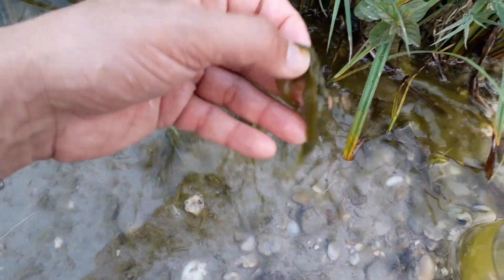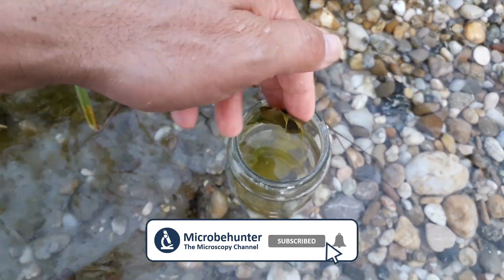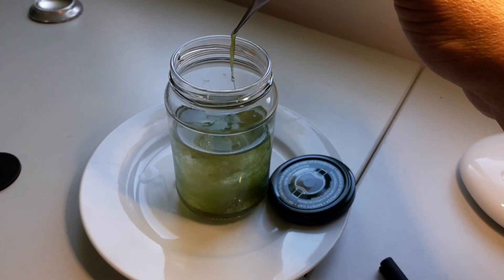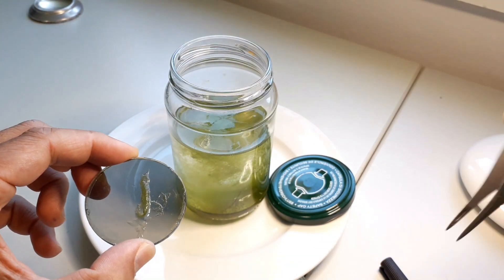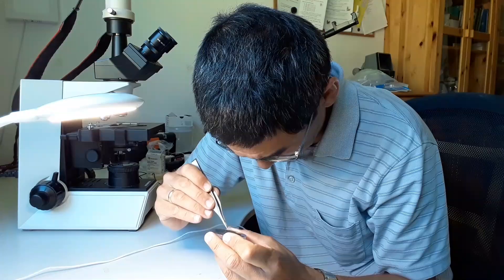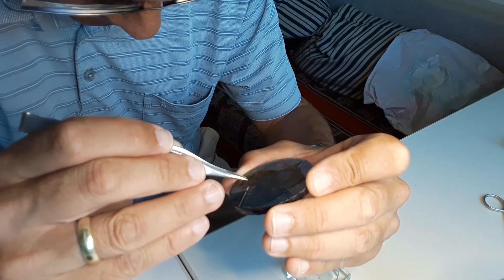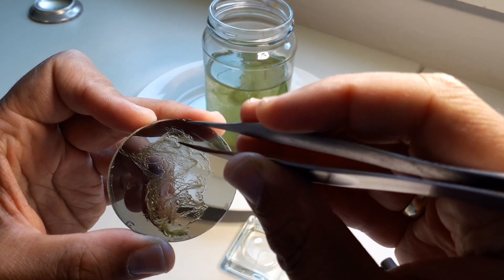First the work, then the fun. Before I cut apart the worms I have to find them first, and this is how I collected them. They can be found living in algae, which I took home in a glass jar. At home I placed some of this material on a glass plate, separated the algae, and tried to find them. They were tiny, so I spent quite a bit of time searching through the material, and I collected around five of them — which took me maybe half an hour.